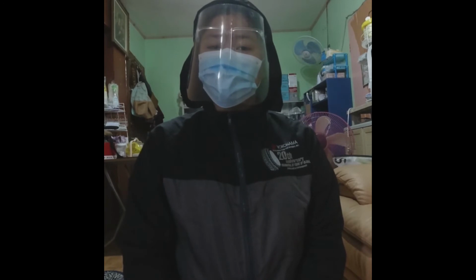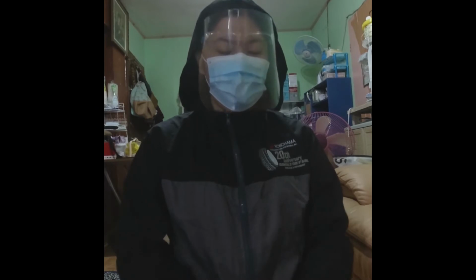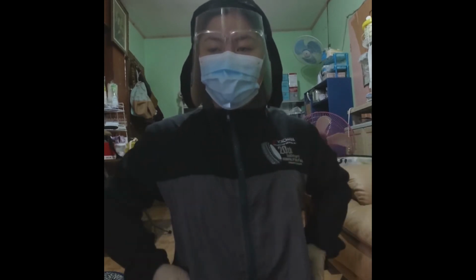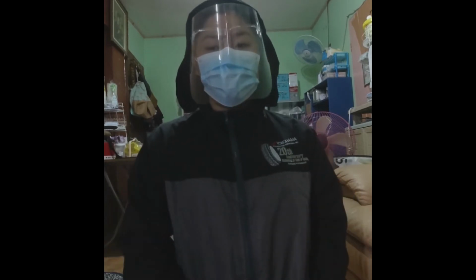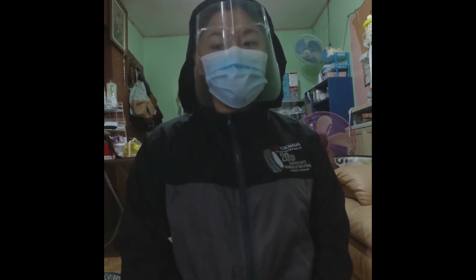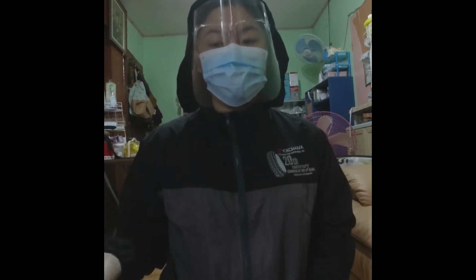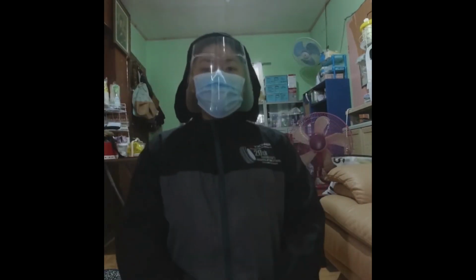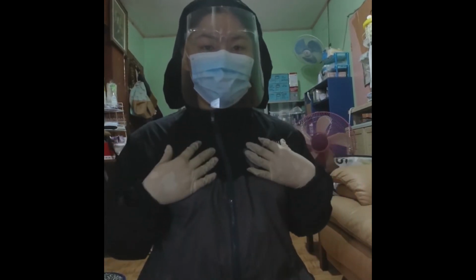However, some parts of the jacket are not entirely waterproof, such as parts made of cotton, like the cuffs or the pockets. Its susceptibility to water could easily result in microbial growth and contamination. It is also disadvantageous that it only covers the torso. In actual PPEs, the body protection is a gown that covers both the torso and the legs, mitigating the chance of contamination in the transition from jacket to pants.